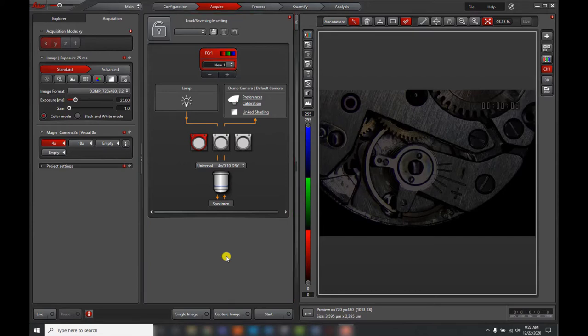Furthermore, the default interface requires users to press live to activate the camera image, which is valuable when looking at things like fluorescence to reduce photo bleaching. However, it isn't needed by the typical bright field microscopist who automatically wants to see a live image. For people who have previously used LAS, or for people who don't need to image multiple fluorescent channels, we often recommend using LASX Easy Mode, which removes a lot of the non-applicable features and simplifies the interface.